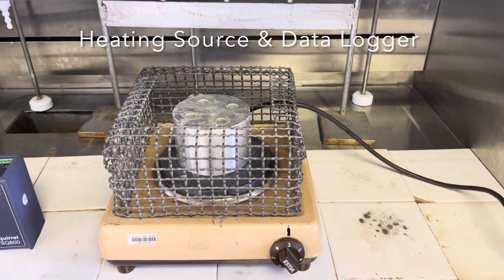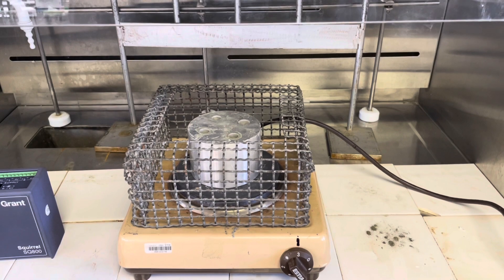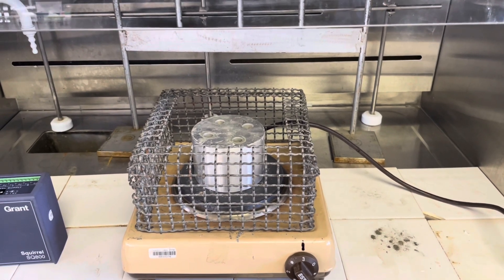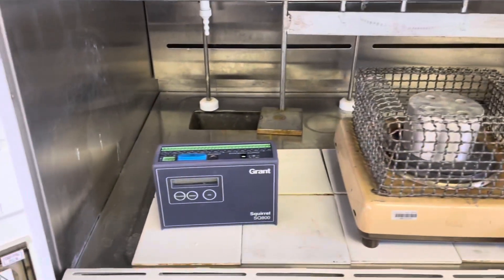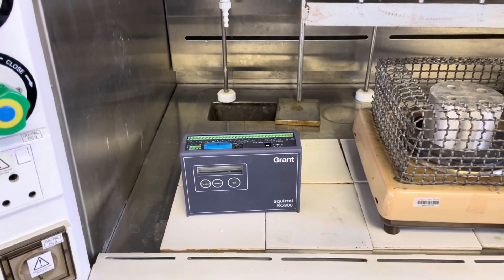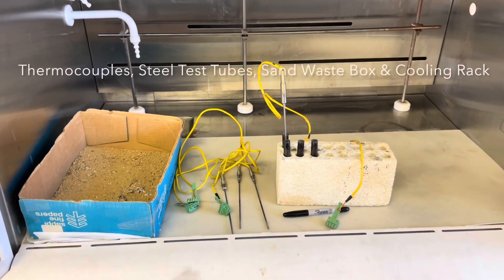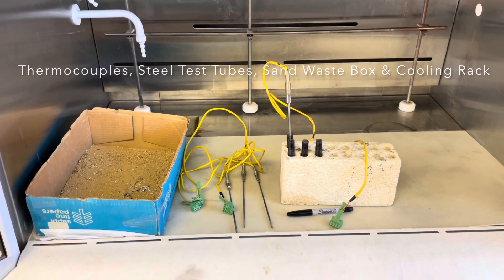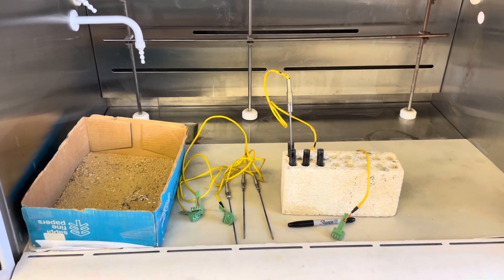In this experiment we will require a heating source, which in this case is a metal block with holes drilled in it to support the steel test tubes. We will also require a data logger, which depends on your specific lab day. You also require a sandbox for waste, thermocouples, steel test tubes, and a cooling rack.